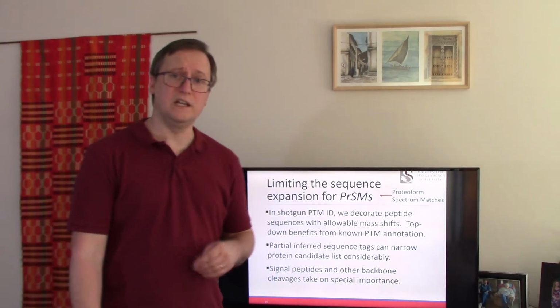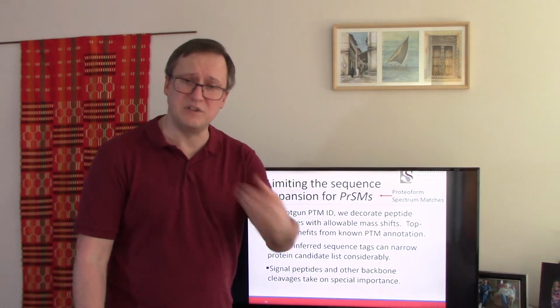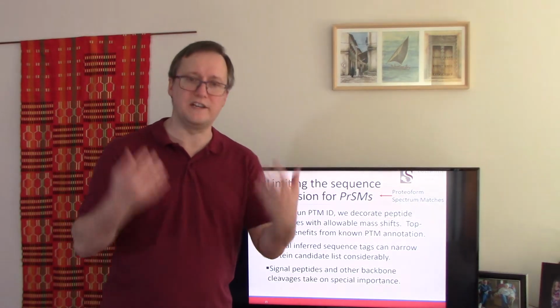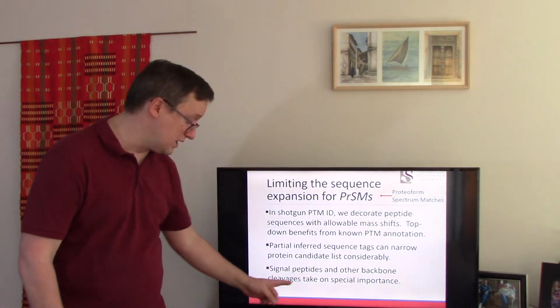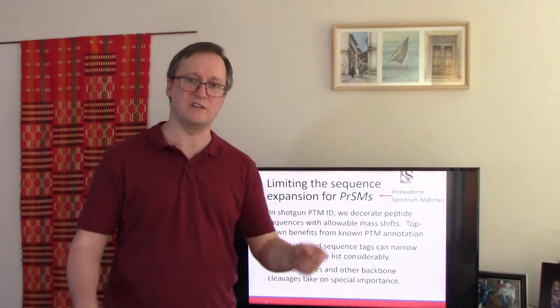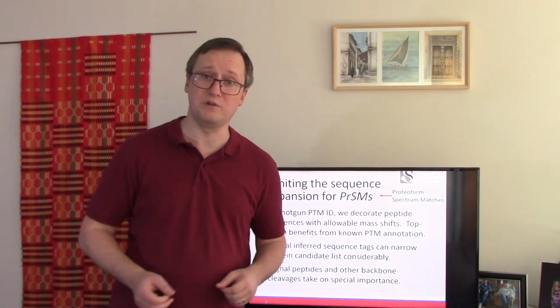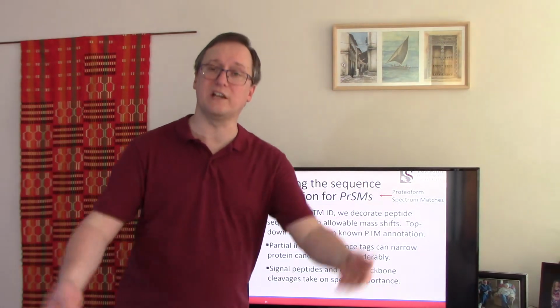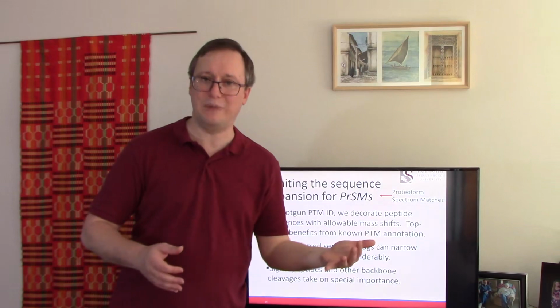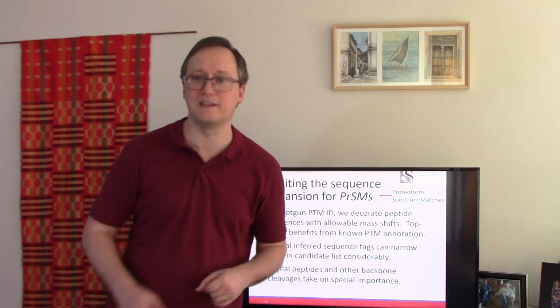And finally, if you're using a protein sequence database with annotation, like the UniProt downloads that are not in FASTA format, you probably have some indication of where signal peptides are believed to be on these protein sequences. And so in silico, you can think about what would the sequence look like if we remove the signal peptide. Very helpful in this case.